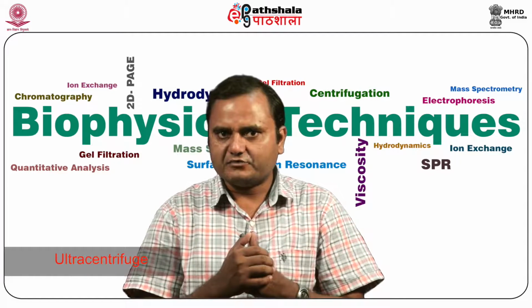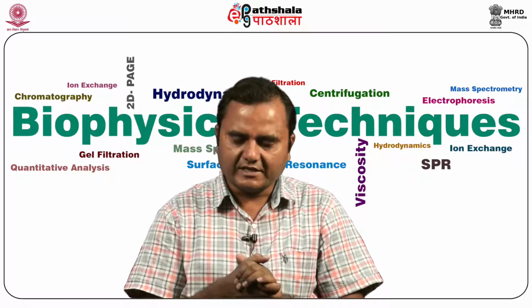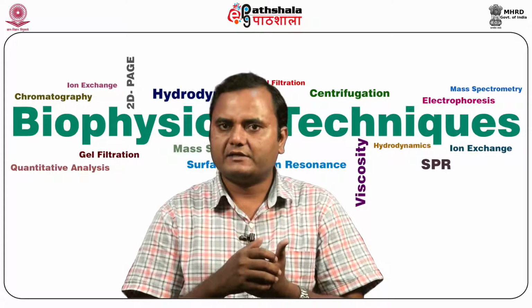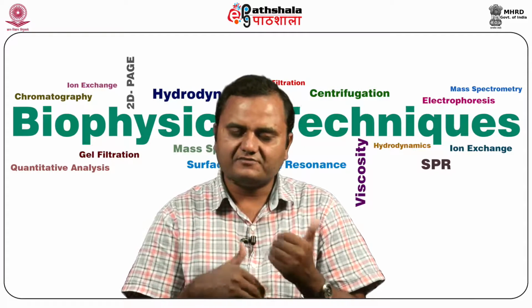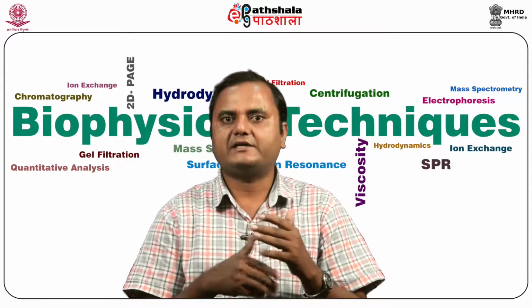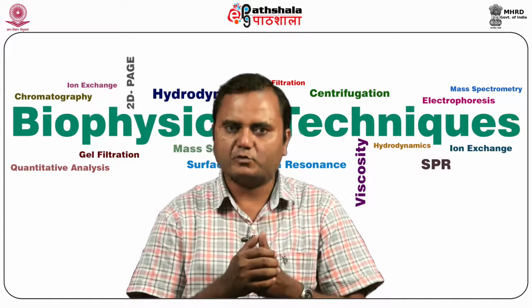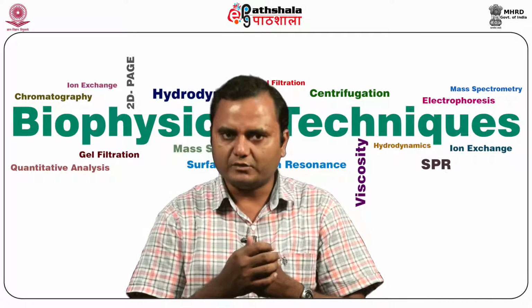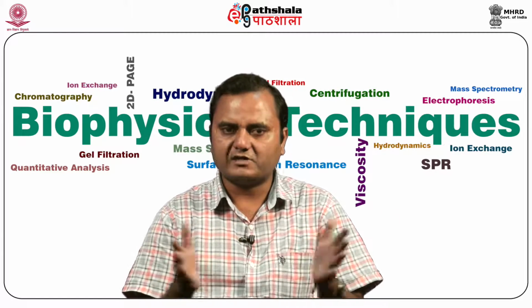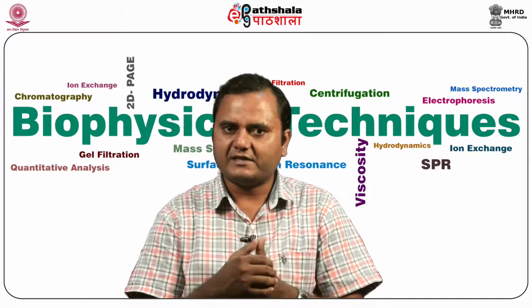So the ultracentrifuge is actually the most advanced form of the centrifuge, and it is a very costly technique. It is actually the additional advancement, additional features applied to the normal centrifuge, and these features are in terms of the speed. So here you can run up to more than 100,000 G value, and that is mainly helpful for the separation of many biological molecules from each other. It has both applications, preparative and analytical.